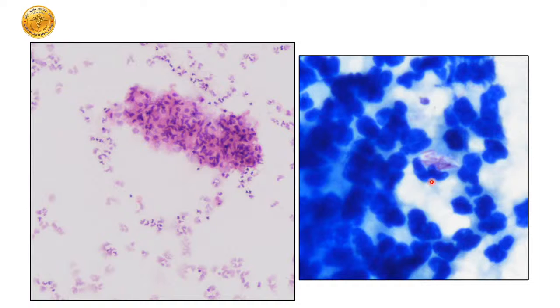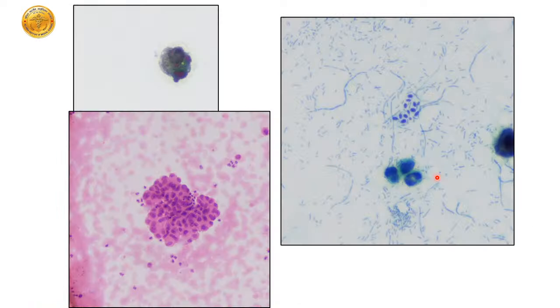So please remember, the source of a granuloma in urine may not be only intravesical BCG instillation. We definitely need to keep other things in mind, however uncommon they may be. Next slide, please. This is not coming up very well, but these were elongated acid-fast positive bacilli.